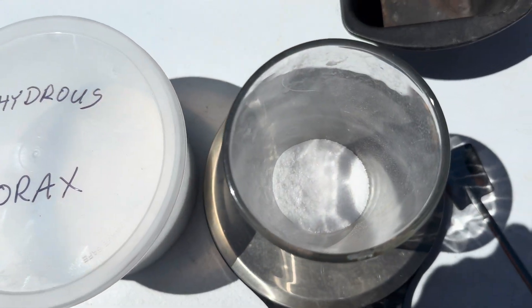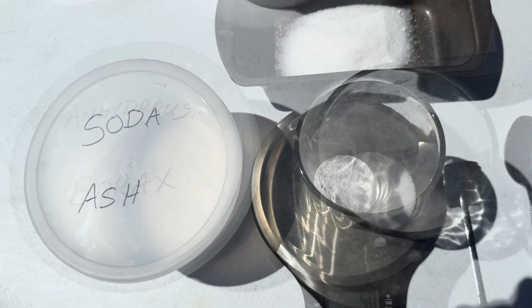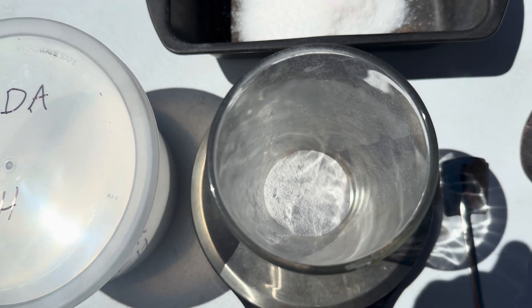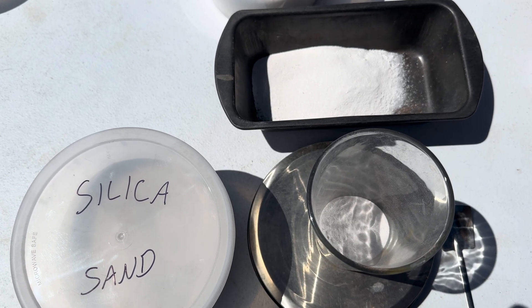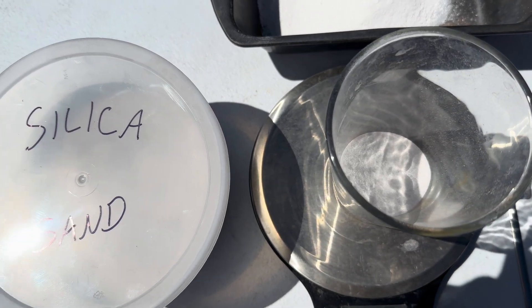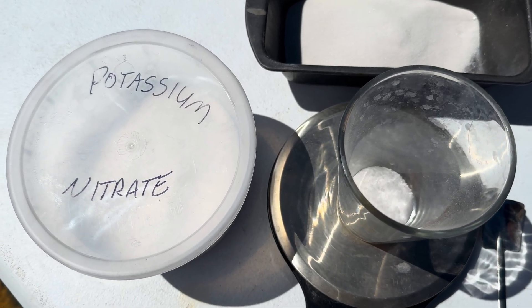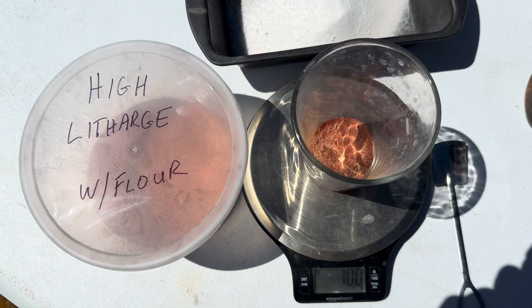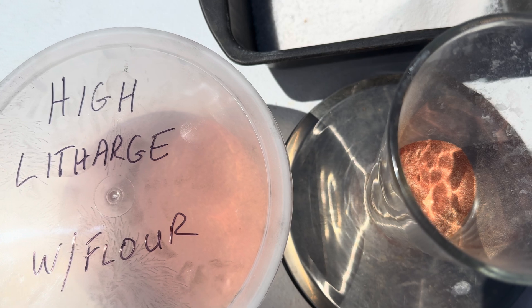First we're going to add in 100 grams of anhydrous borax. Second, we're going to add in 50 grams of soda ash. Next, because we have no concentrate, we're going to add in 100 grams of silica sand. Then we will add in 30 grams of potassium nitrate, and lastly I will add in 100 grams of high litharge with flour.